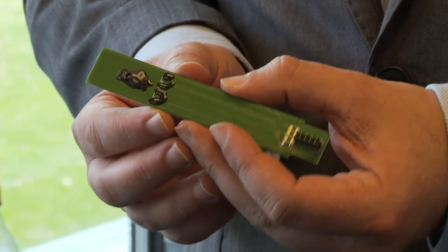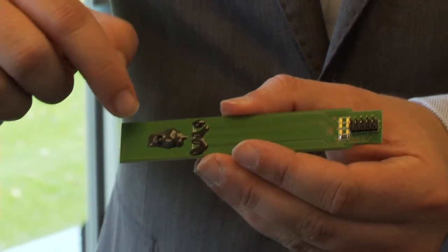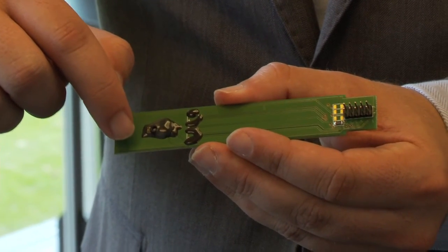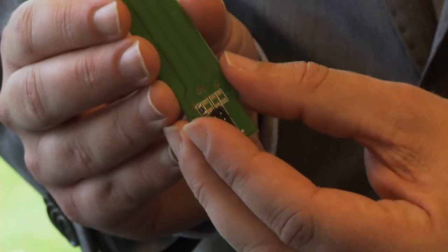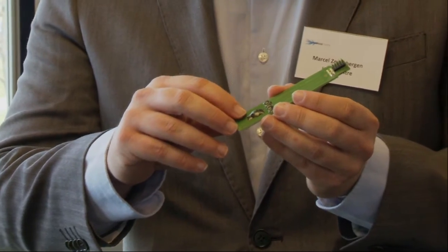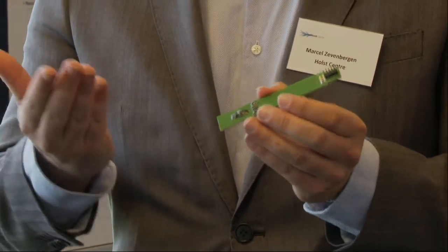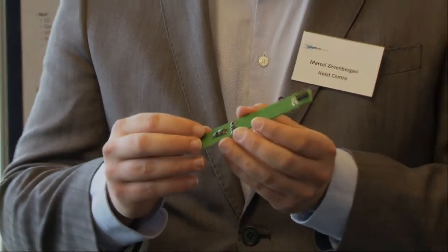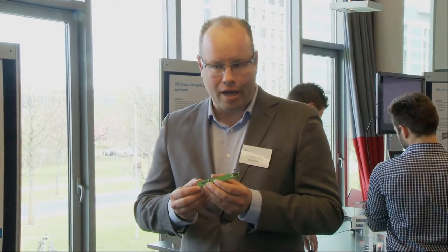We have developed an all solid state sensor. This means that there is only a single chip having multiple electrodes, each sensitive to a different compound in the fluid. We achieve this by having multiple materials on this chip which we modify such that they are solely sensitive to one compound in solution. By having multiple electrodes we can make a multi-ion sensor which can detect multiple ions simultaneously.